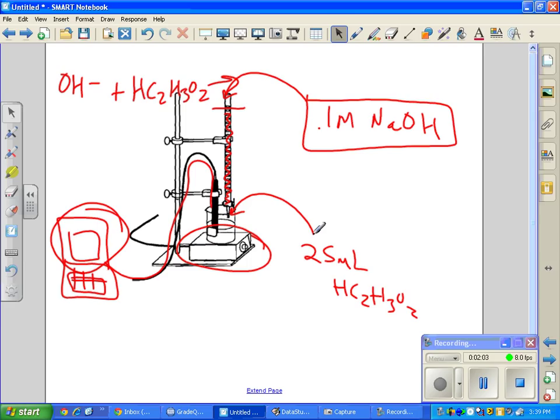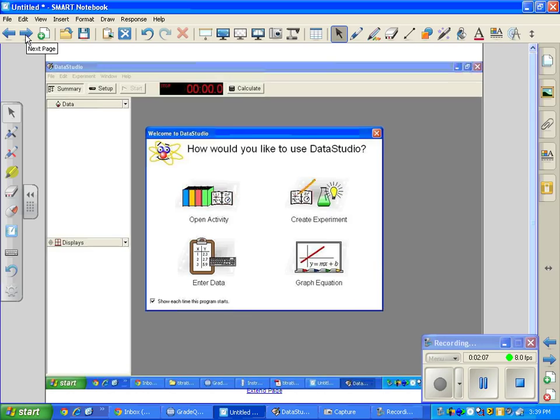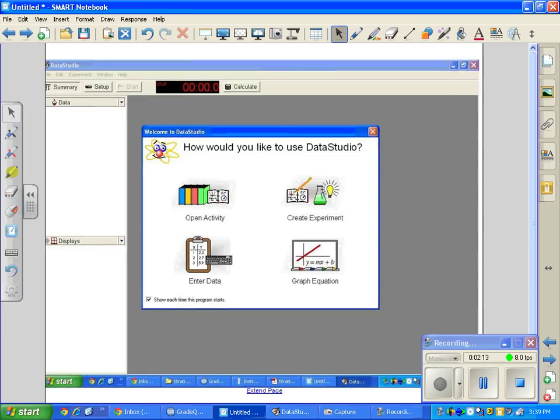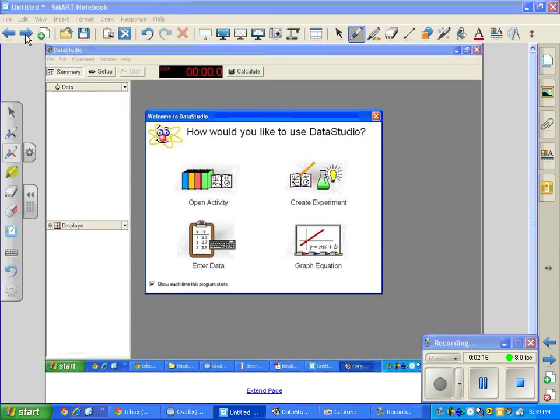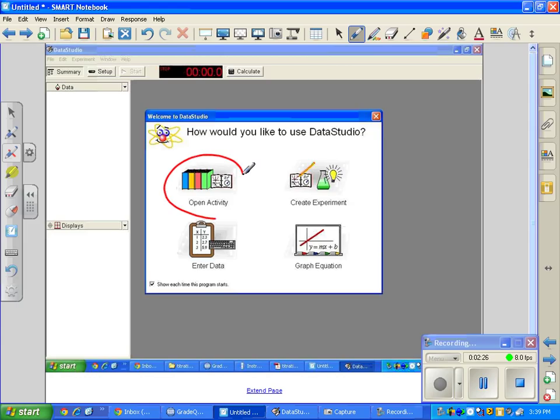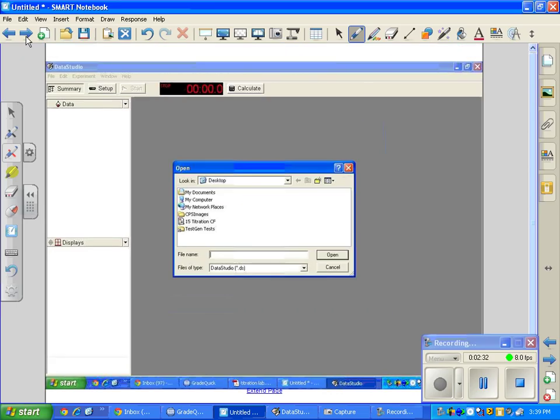First, you're going to do this on a Mac, but it will look similar. When you set it up, you're going to open a program called Data Studio. When you plug the USB connector in first and then plug the probe in, it automatically opens to that screen, and you're going to pick Open Activity. The next screen will show a file on the Mac desktop called '15-titration-cf' — that's the file you need to open for this lab. Click on it, click Open, and it opens to the next screen.